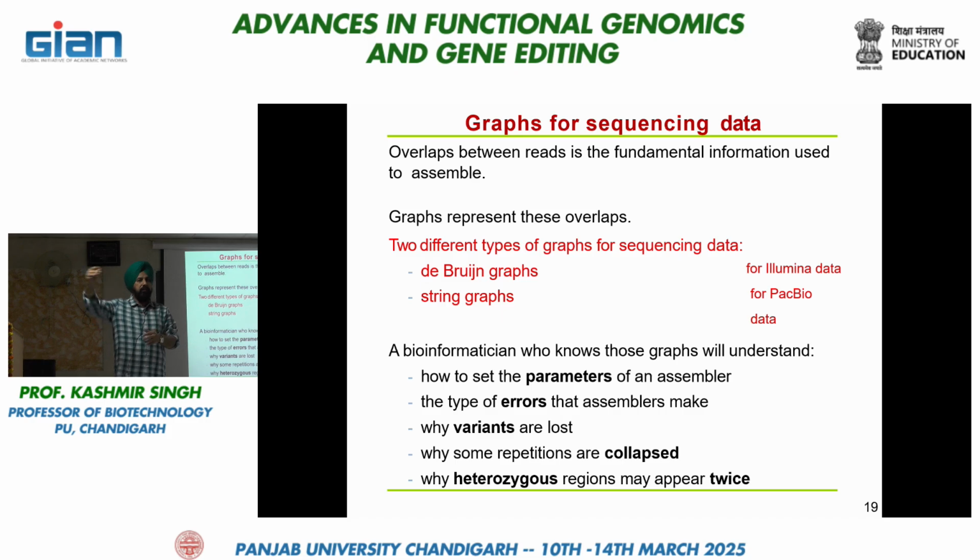Then you will have a very large number of contigs. In the earlier case you will have longer contigs but fewer in number; in this case you will have smaller contigs but very high in number. So you have to find the ideal situation, not like this, not like this, where your assembly will be ideal and you have an appropriate size of contig. The data is also significant, so we try on the computer by giving different overlapping parameters.